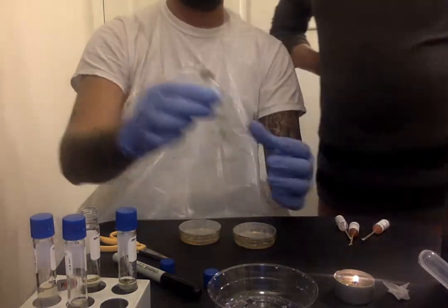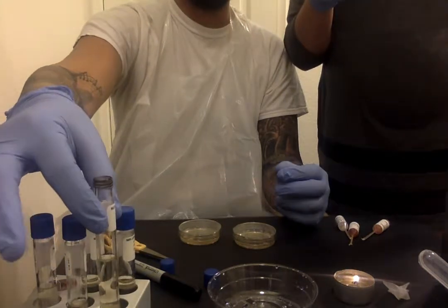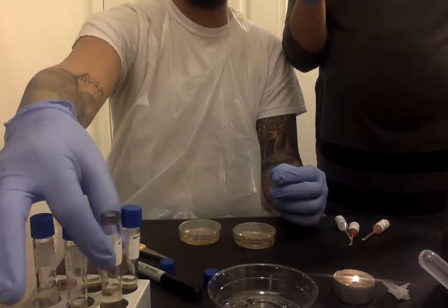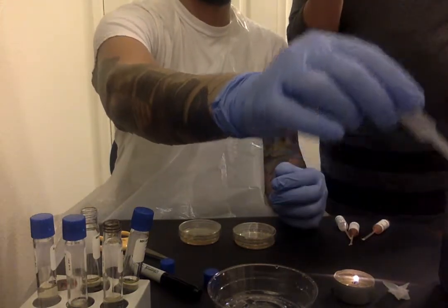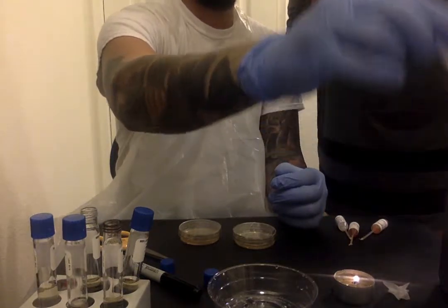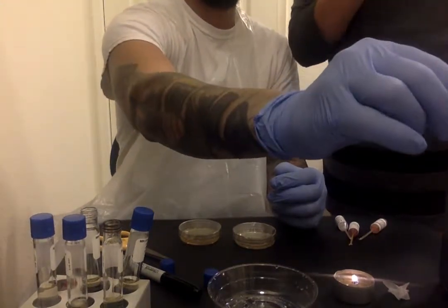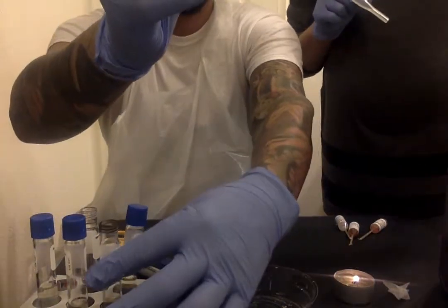Okay, so what you are going to do is get the pipette. Should I put this back? Yeah, that's fine. Just remember which one is which. Get the pipette. Shake it so that there is no alcohol. Carefully insert the tip of the pipette into the active E. coli culture and draw up a small amount of broth.